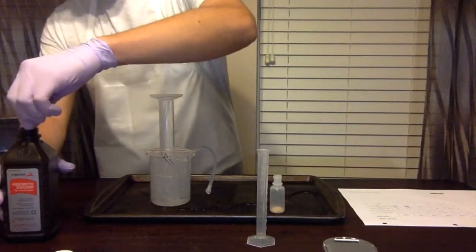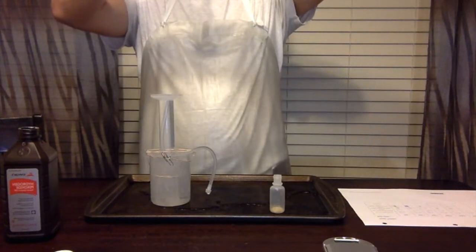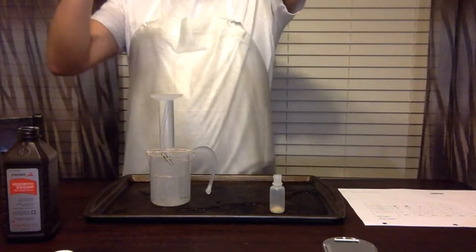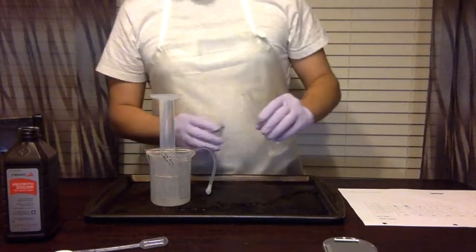Again, we need 3 milliliters of hydrogen peroxide. Here we go.